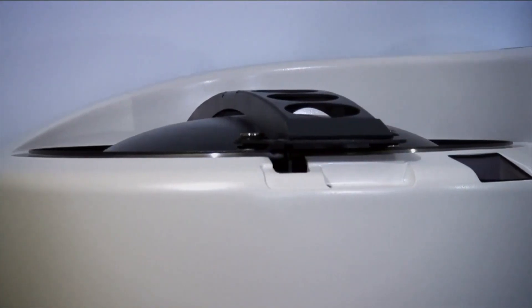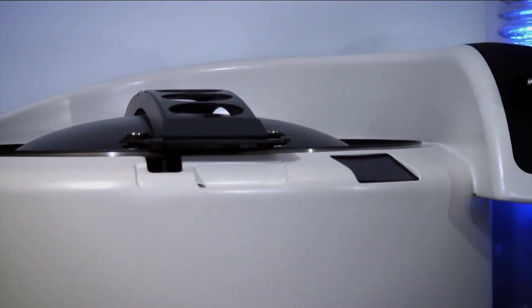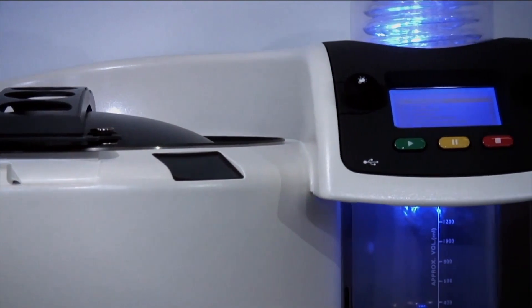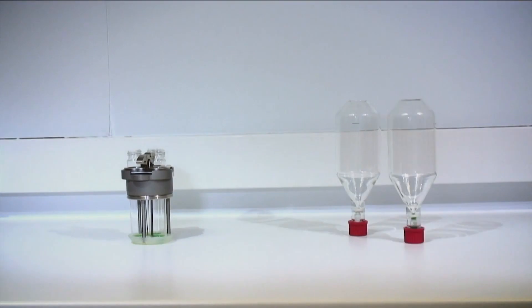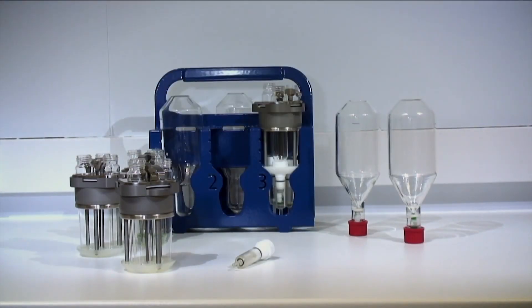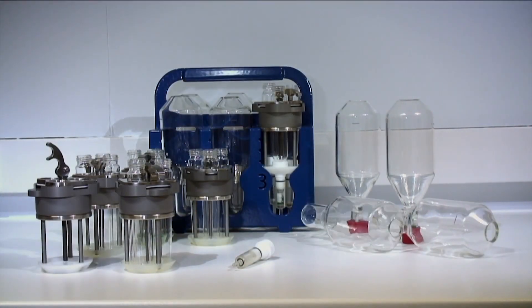The rocket contains a fully optimized heating arrangement. The energy released by condensing steam is massive, yet controlled at a safe temperature. The rocket evaporation system is designed primarily for large volume, parallel evaporation.